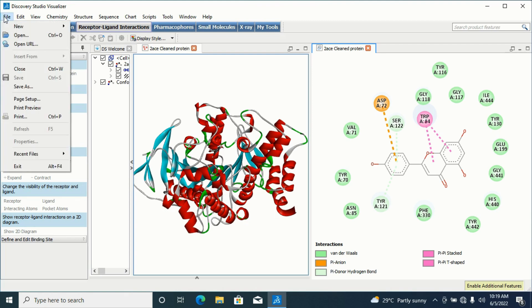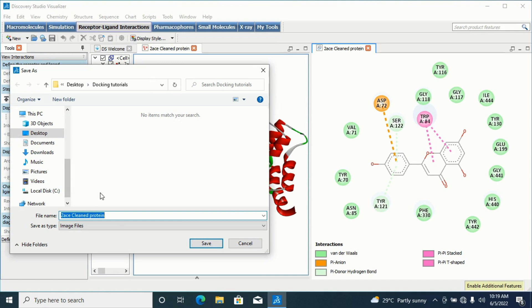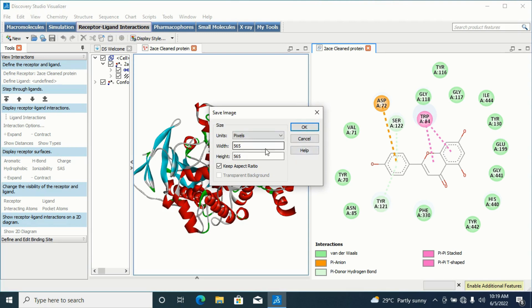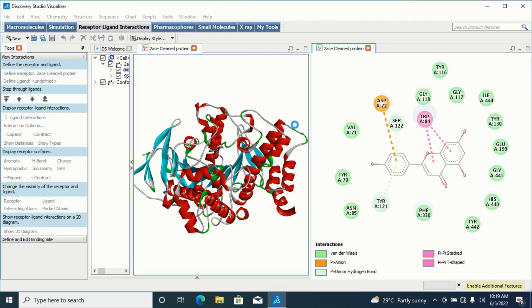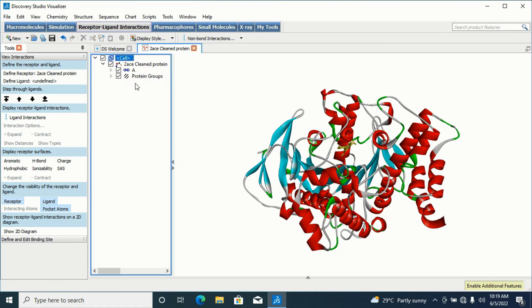To save this diagram, I'll go to File, then Save As, and title it 'Diagram 1'. I'll save it as an image file in my docking tutorial folder. This dialog box will pop up — I'll click OK to leave it at the default setup and save. To insert another conformation, you must come back and delete the one already inserted using the Delete key on your keyboard.